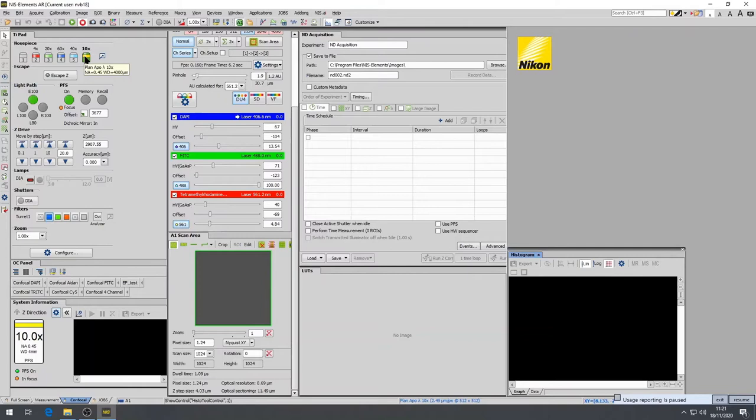Add immersion oil if necessary. Please do not put oil on an air objective.